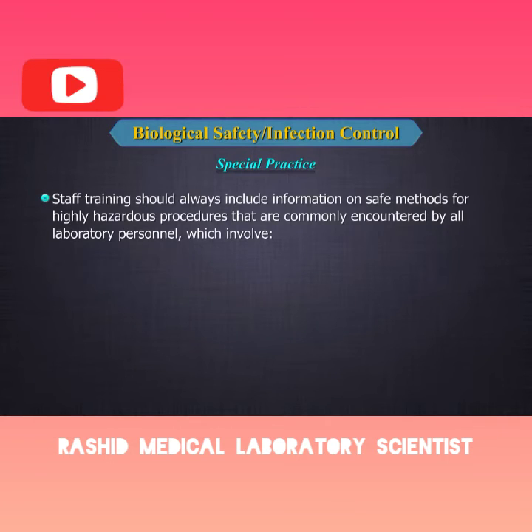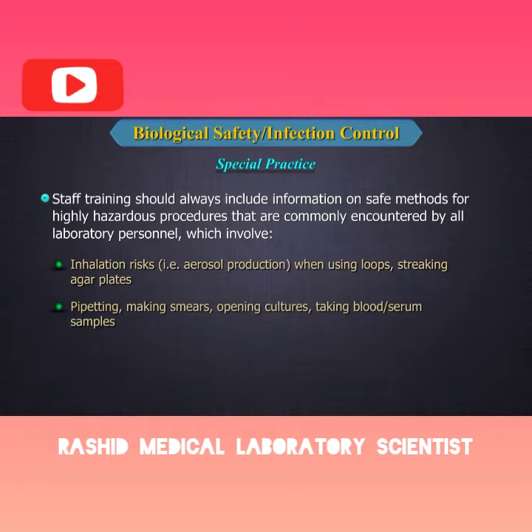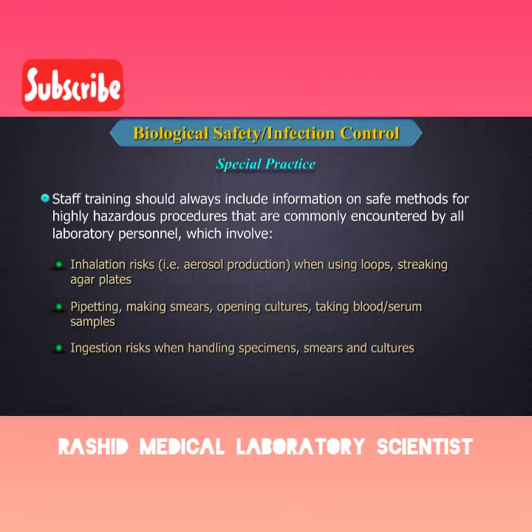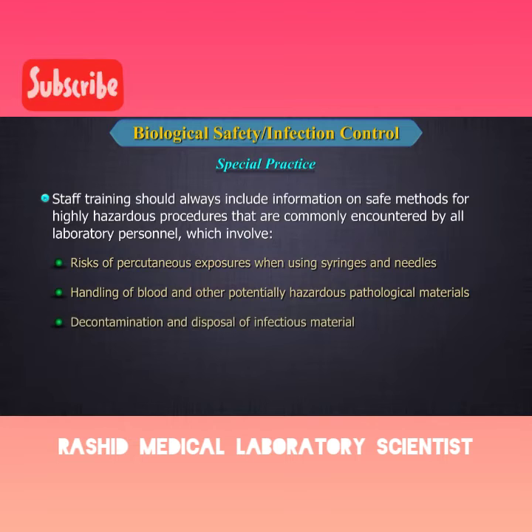Staff training should always include information on safe methods for highly hazardous procedures that are commonly encountered by all laboratory personnel, which involve inhalation risks, that is, aerosol production, when using loops, streaking agar plates, pipetting, making smears, opening cultures, taking blood or serum samples; ingestion risks when handling specimens, smears, and cultures; risks of percutaneous exposures when using syringes and needles; handling of blood and other potentially hazardous pathological materials; decontamination and disposal of infectious material.